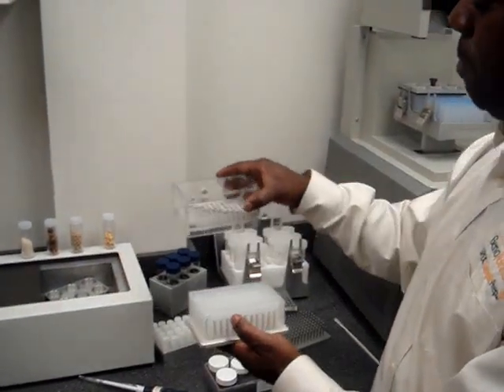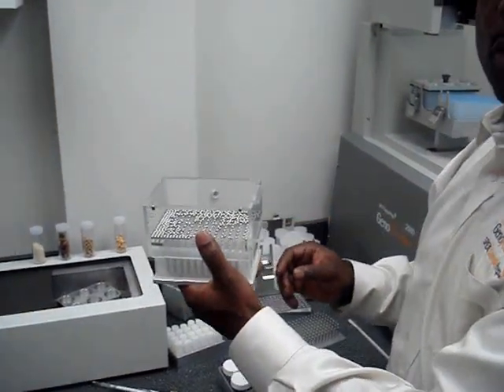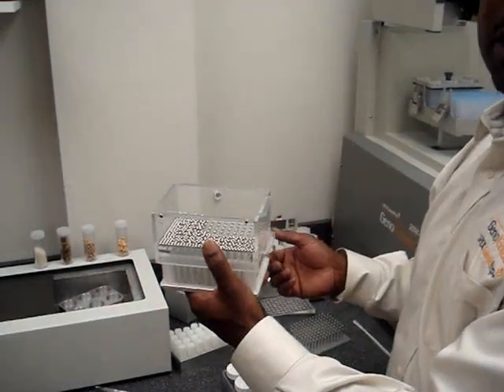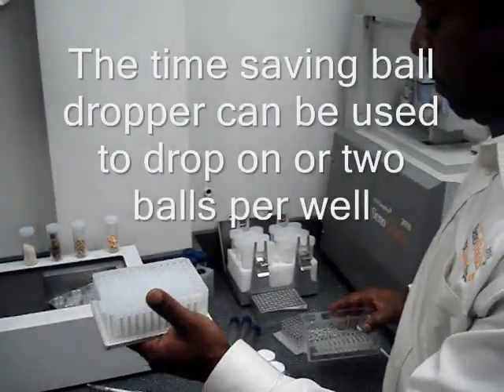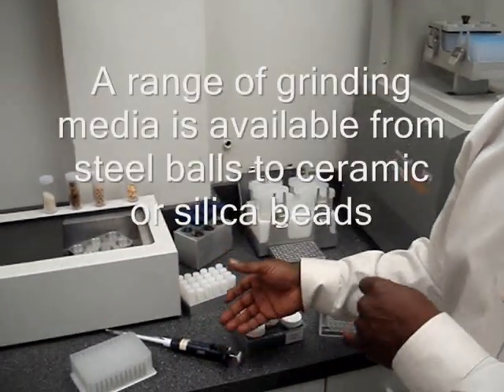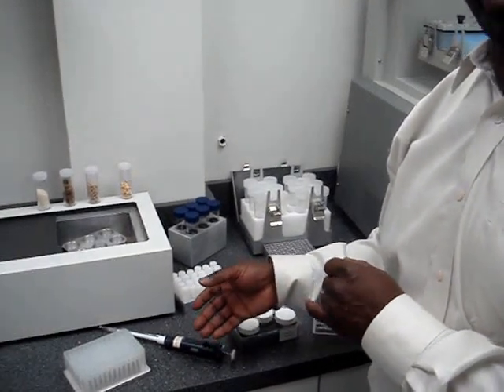We have a sophisticated ball dropper here that was designed by Spex Sample Prep. This will actually introduce the balls to the well before introducing your samples and your buffer solution. One touch of the button here will actually drop the balls in the well. Once the balls are in the well you can now start adding your sample and your buffer solution. It can be run dry or wet.